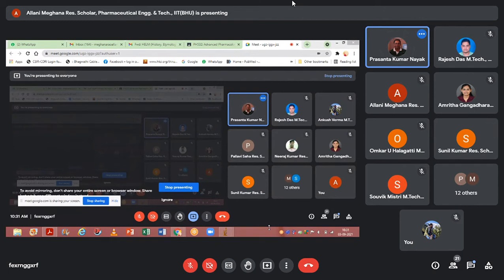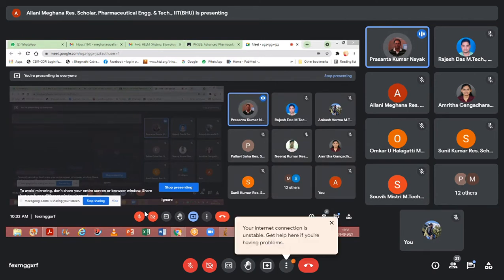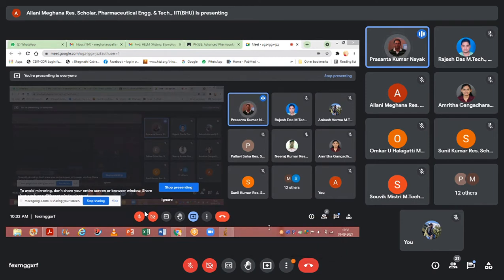But sir, in what we are doing, are we showing any role of the drug? Didn't you see? Sir, actually we haven't taken that we are using the drug. But we have done that. The third group was kainic acid plus drug. You haven't seen it fully. Saline control is the group where we have 5 animals. They were given only saline: saline plus saline. But in the second group, it was saline plus kainic acid in saline.